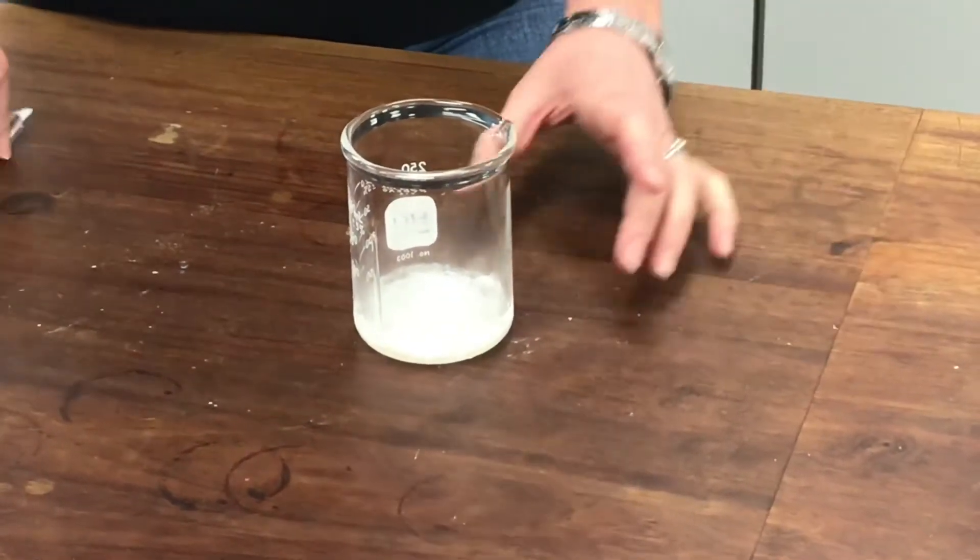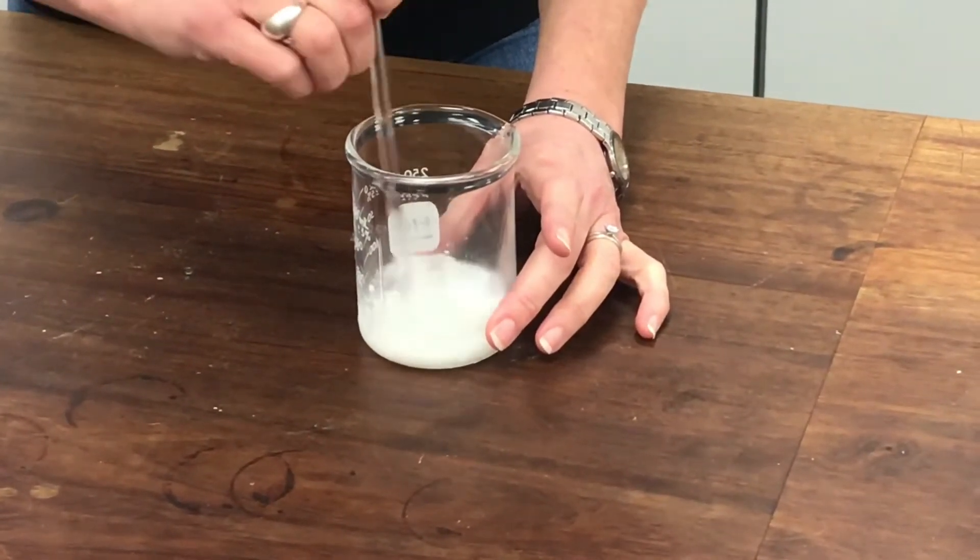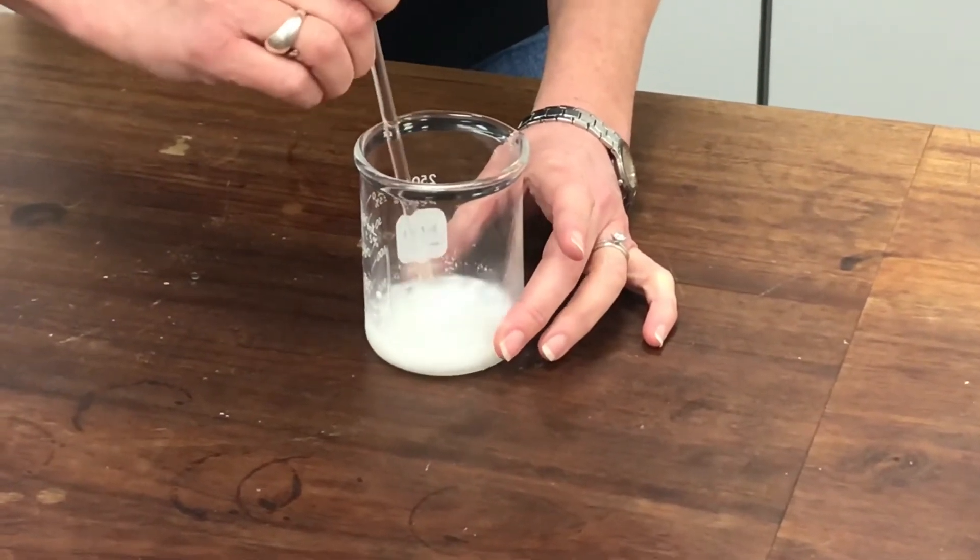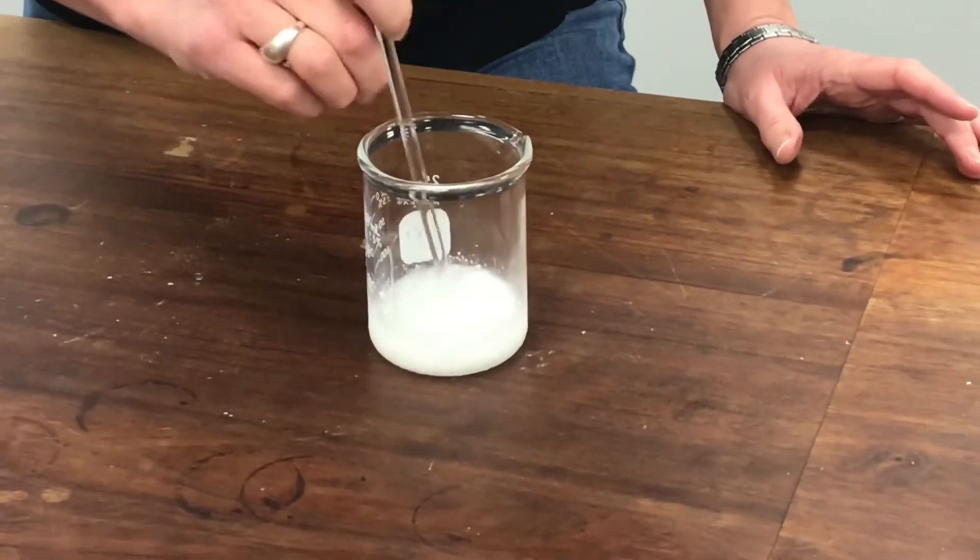I've got to stir this now until all that crushed ice has melted. And hopefully I should have a nice amount of crystalline nitrated methyl benzoate, which I'll be able to recrystallize. So I'll join you again in a minute.